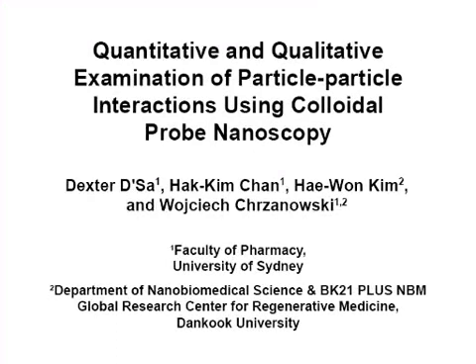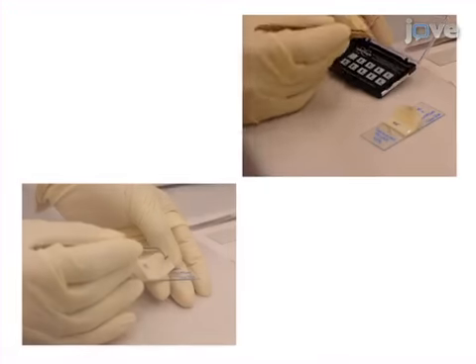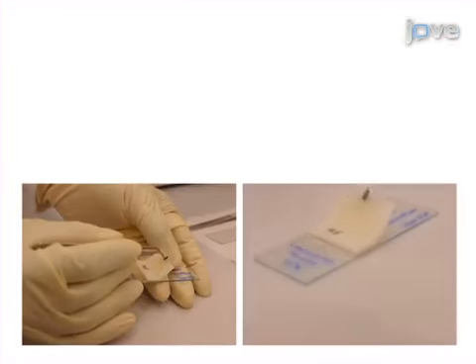The overall goal of this procedure is to obtain quantitative information on the nanoscale interactions present between particles in a liquid-based colloidal system. This is accomplished by first preparing a functional colloidal probe by attaching a single particle onto a tipless atomic force microscope cantilever.